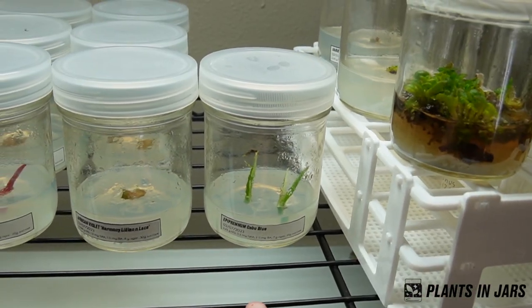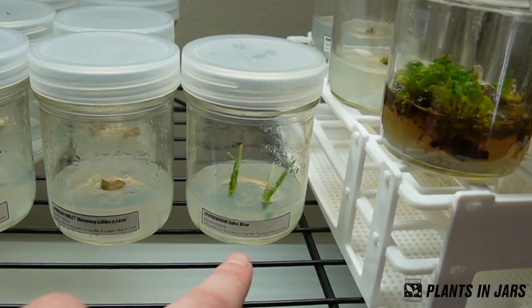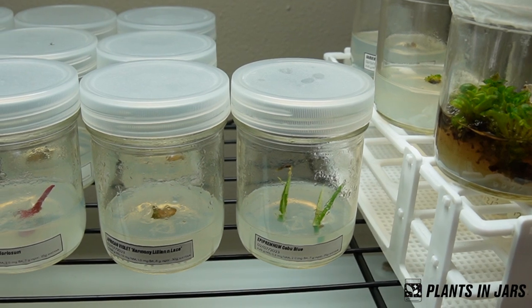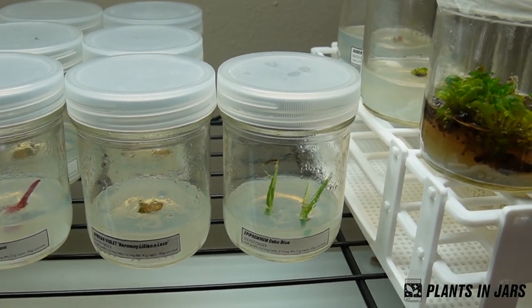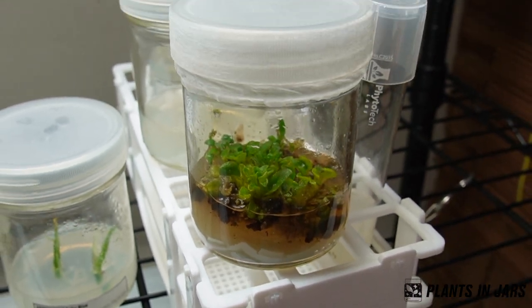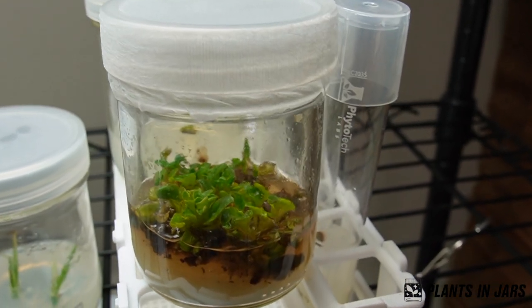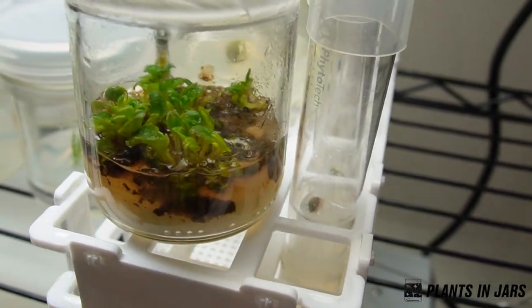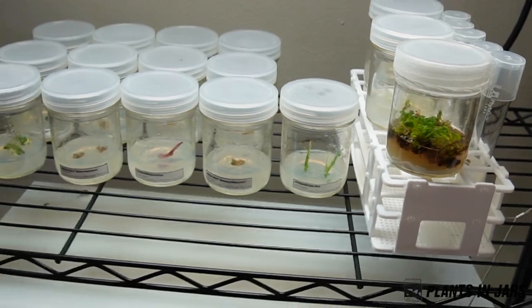And then this is Pothos Cebu Blue — I'm just doing that one for practice. I bought the Toruno World Pothos that I showed at the beginning of the video to actually put into tissue culture. These should be ready in about a month to take out of tissue culture. I think these are African Violet RS Operata, but that was from my first ever time trying to do tissue culture so I was really bad about writing down what I was doing.